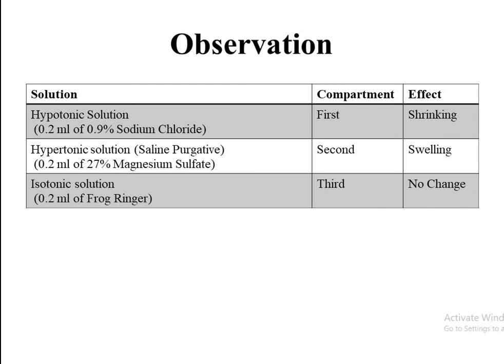in the presence of hypertonic solution, which is basically a saline purgative, because all the saline purgatives which we take are highly hypertonic in nature, the hypertonic solution is responsible for swelling of the stool, or you can say the intestinal lumen. In isotonic there will be no change.